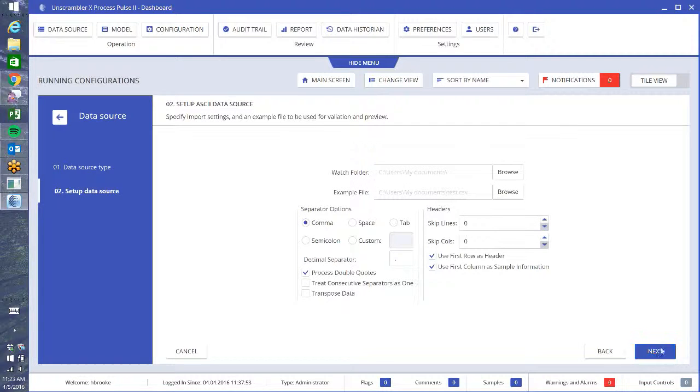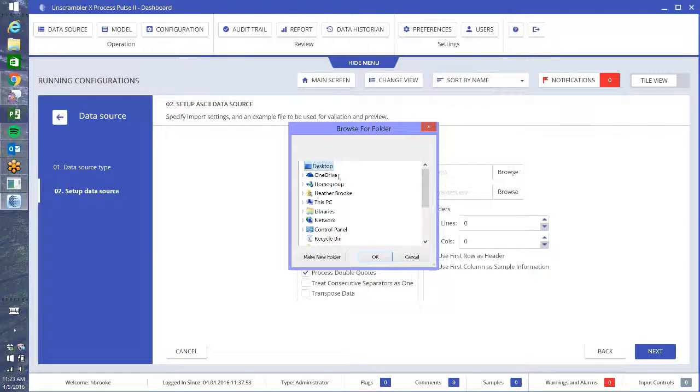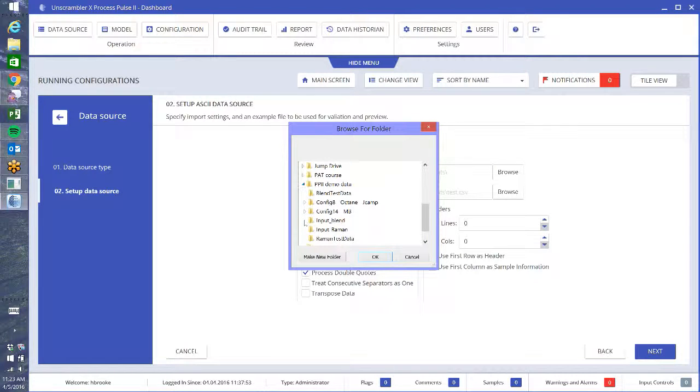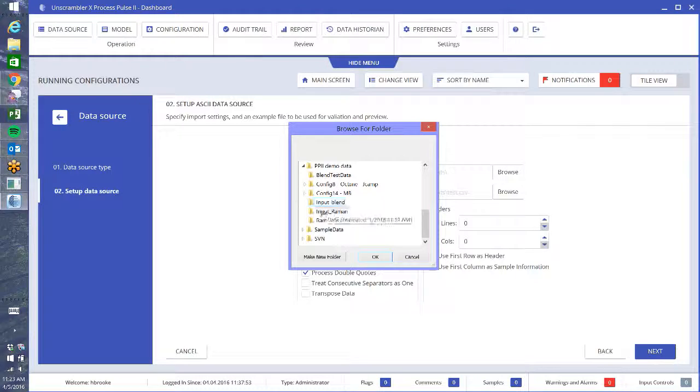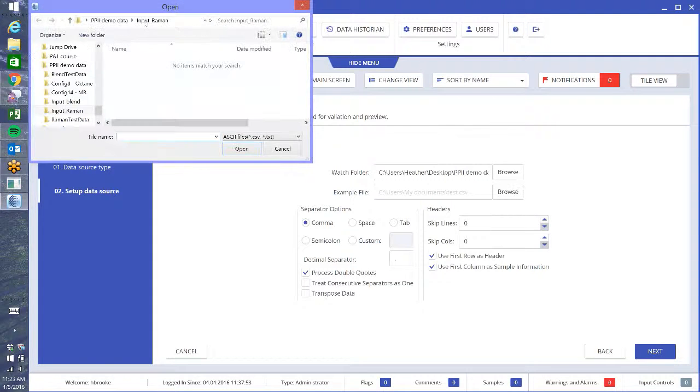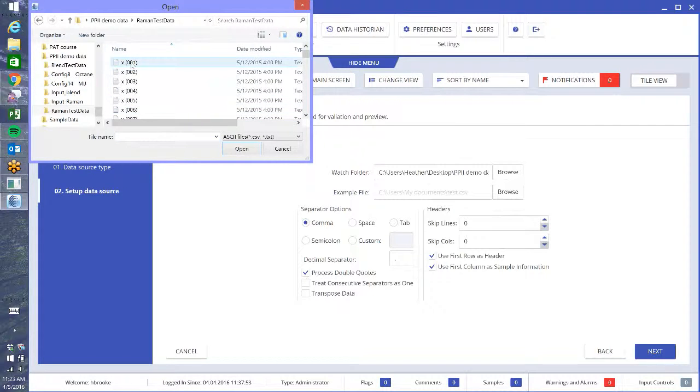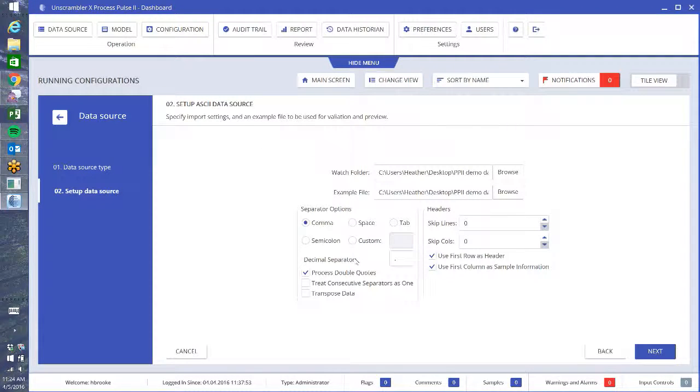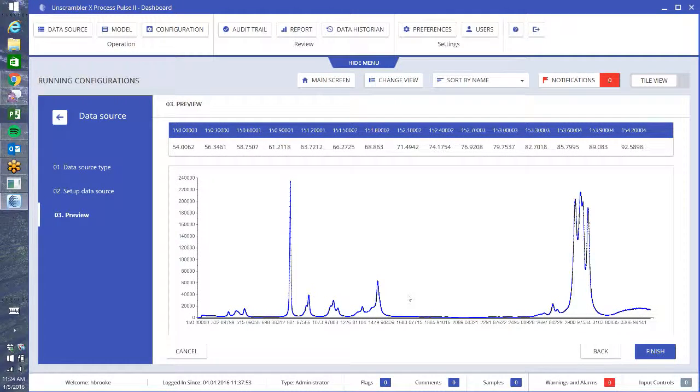Here I have all my options. When you use ASCII, you're actually looking at a watch folder, so I'm going to browse to where I am going to save my files. So demo data, I'm going to do input Raman. This is where Process Pulse is going to look for new files coming in. I just need to go up one and what we need to do is give it an example file. This is just so you can check and make sure that all of your settings are done correctly. I press next, and this is my preview. This is some spectroscopic data, it's Raman data, and it looks like what I'm expecting.